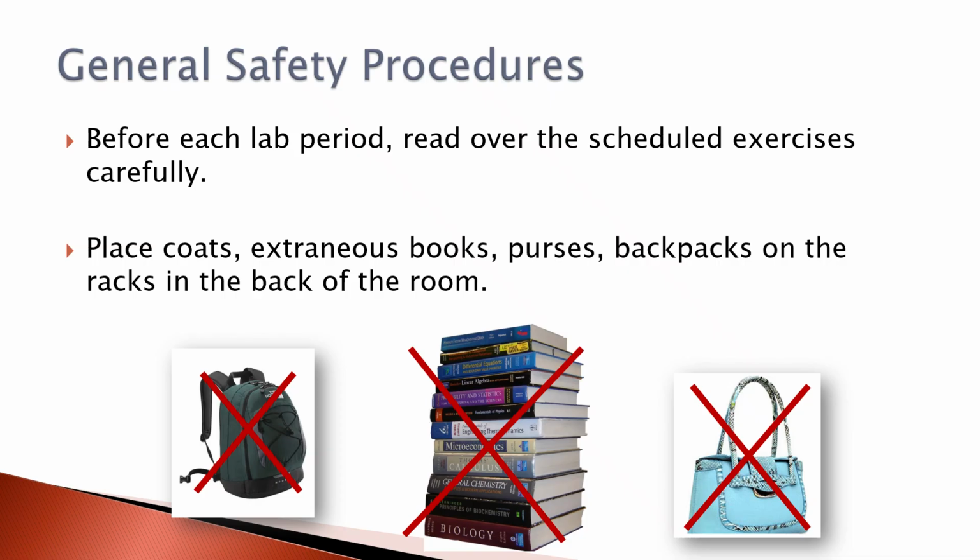There was a situation up at Clemson a number of years ago where inadvertently a tube of, I think it was strep, was spilled on someone's lab manual, and then they took it back to their dorm and they got everybody really, really sick. And so they have super strict rules up there about what you can take into and out of microbiology labs. So you always want to be careful. Don't bring anything extra that you don't need because there's microbes everywhere in there, and we deal with some pretty nasty stuff in our labs that can make you very sick. So don't bring anything extra in.